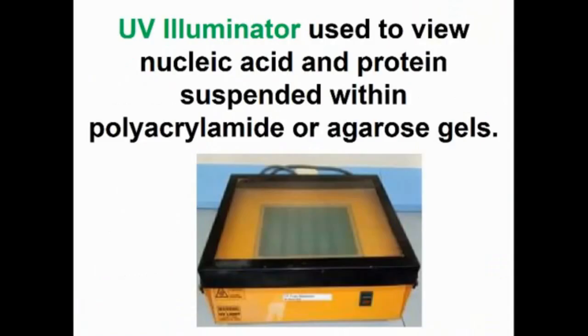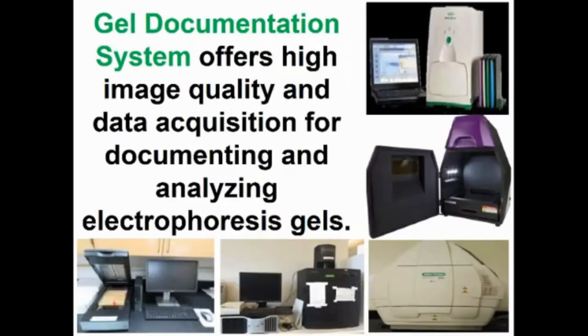UV Illuminator, used to view nucleic acid and protein suspended within polyacrylamide or agarose gels. Gel Documentation System, offers high image quality and data acquisition for documenting and analyzing electrophoresis gels.